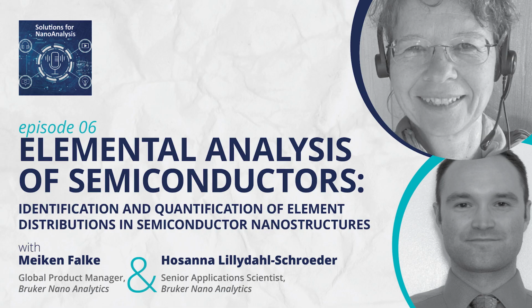One aspect is the collaboration. I would wish we would have more EDS suitable TEMs and SEMs. I already touched on that a little bit in EELS. Some acquisition or imaging conditions are good for one thing, and others are good for EDS. And manufacturers are already starting to produce microscopes which can be easily tuned between different options and then also be optimized for the EDS option very quickly. We need to be optimized for EDS. We need high collection angles to be fast.